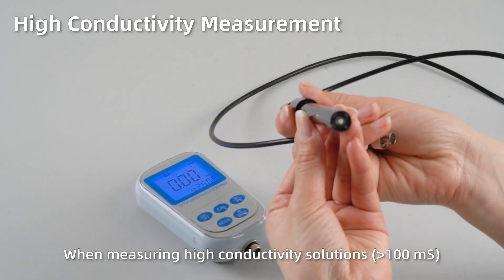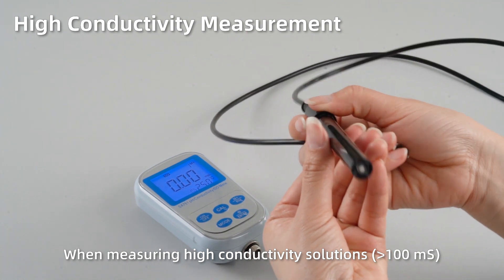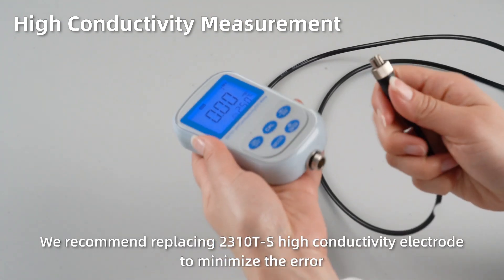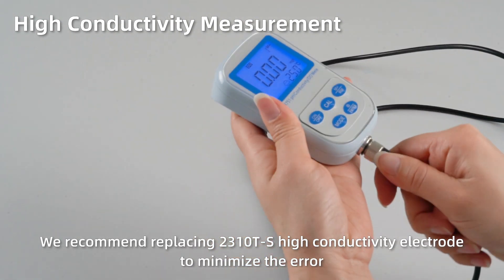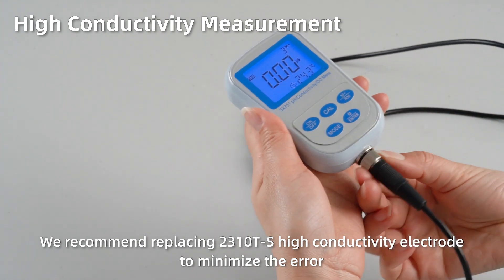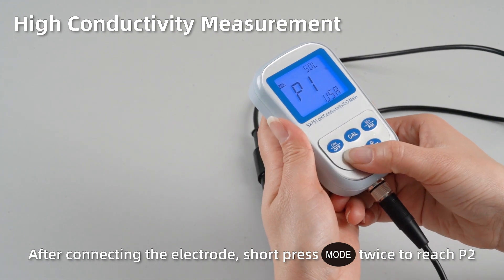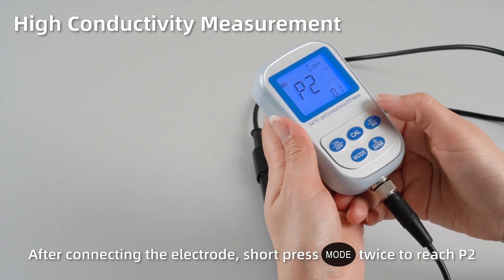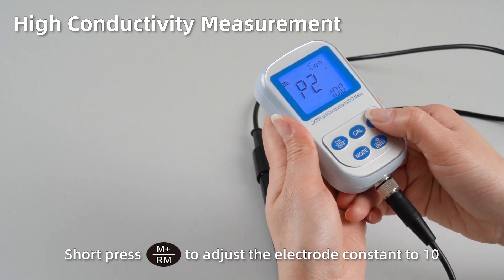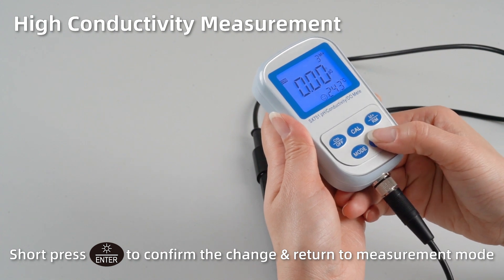High conductivity measurement. When measuring high conductivity solutions, we recommend using the 2310 T-S high conductivity electrode to minimize the error. After connecting the electrode, short press Mode twice to reach P2. Short press M+ to adjust the electrode constant K to 10. Short press Enter to confirm the change and return to measurement mode.